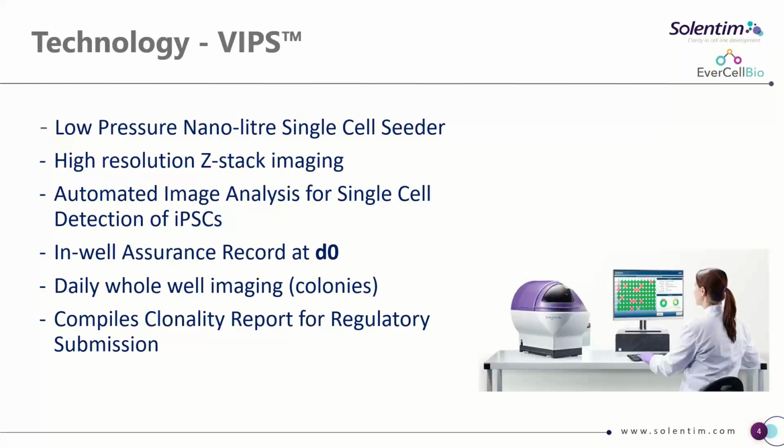So just finishing off with some other comments on the VIPS. It's, as I said, a low pressure gentle system delivering typically a 20 nanoliter droplet. It then uses the images from beneath the microtiter plate, and it does what we call Z-stack imaging. So it takes slices through the droplet and then uses clever imaging software to confirm the presence of a single iPSC in that droplet, and to resolve it from other facets, for instance, bubbles. It does automated image analysis for single cell detection of iPSCs. It does the in-well assurance record at what we call day 0, and then does daily whole well imaging as well, tracking that single cell growing into 2 cells, into a cluster, into a colony. And as I said, it compiles that clonality report.